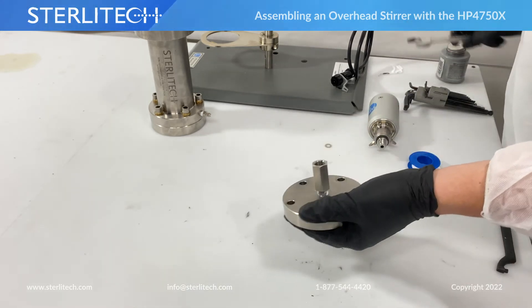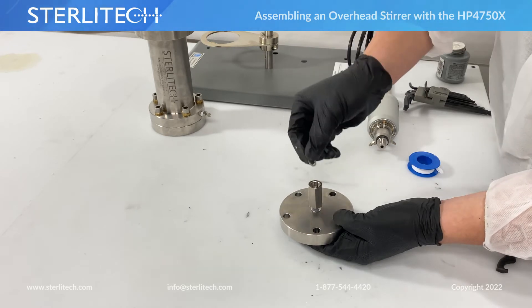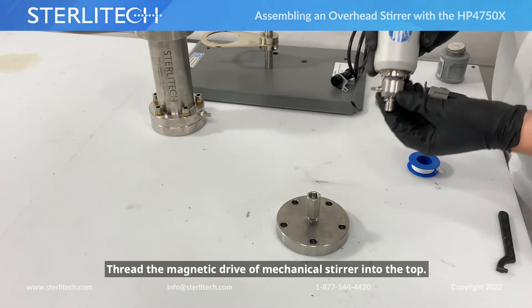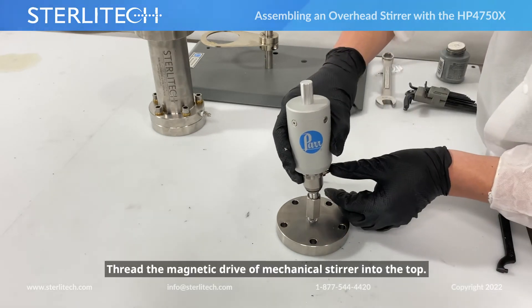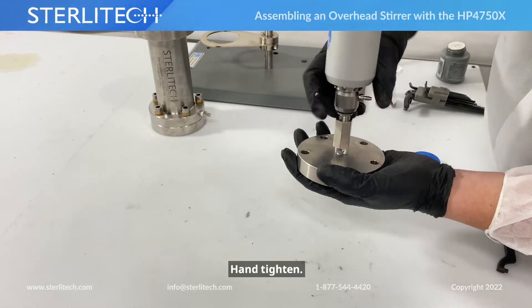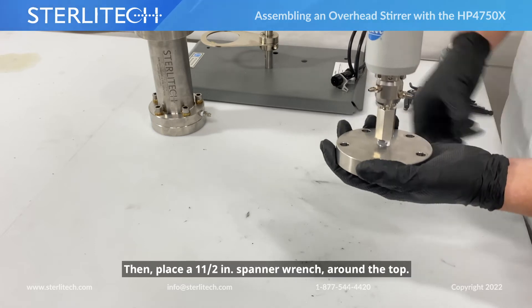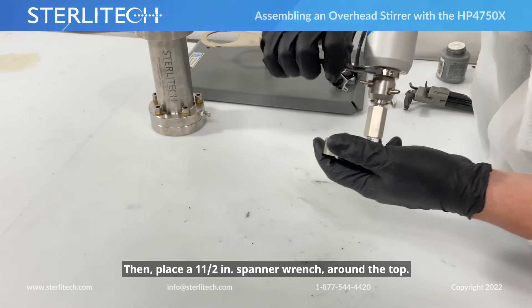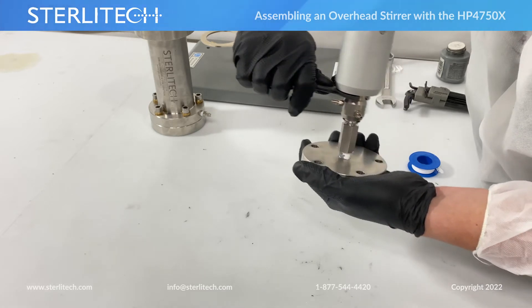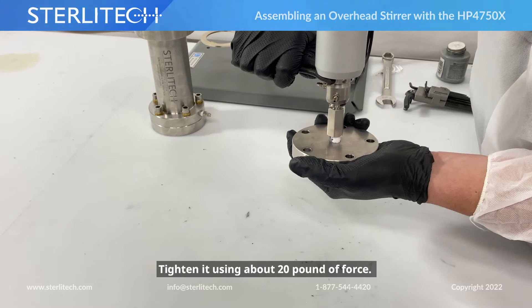From here, we're going to drop our metal gasket into the top. We'll take the magnetic drive of our mechanical stirrer and thread that into the top, snugging it up the rest of the way — same thing, about 20 pounds of force.